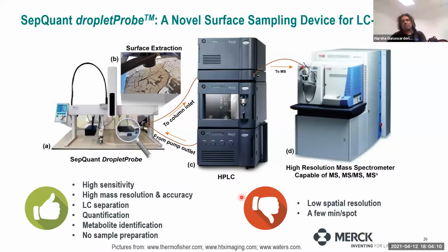When you say speed, how many shots per second for the Advion type method? No, in this case, you're doing one spot every 10 to 15 minutes. Okay, that's what I mean. It's slow. That's why I have this here. I was thinking whether you could do high throughput top-down mass spectrometry. Yeah, you could. You showed a nice spectrum of hemoglobin, right? And you attempted to do top-down, right? Has anybody, or have you seen this been used to do protein imaging?